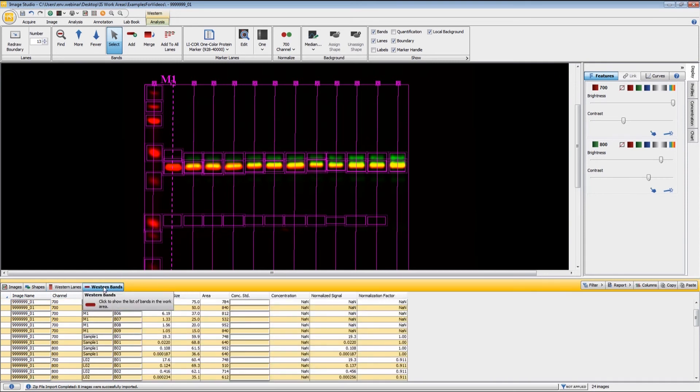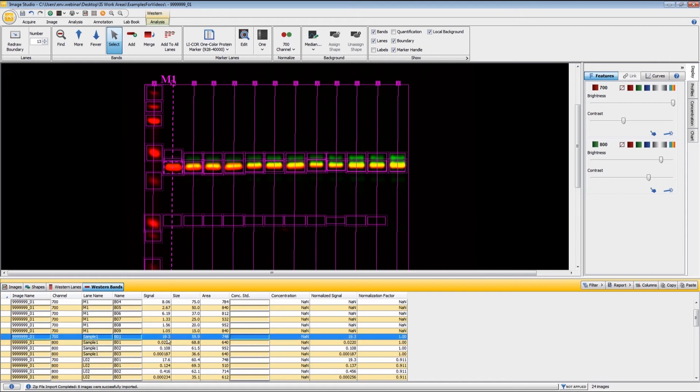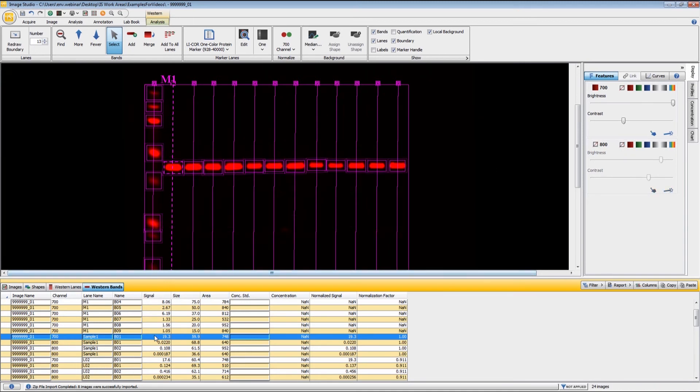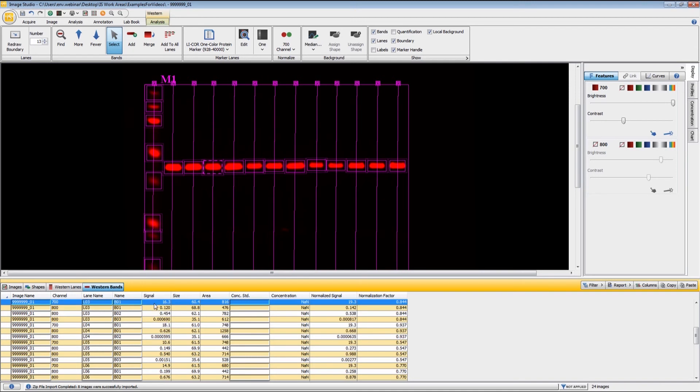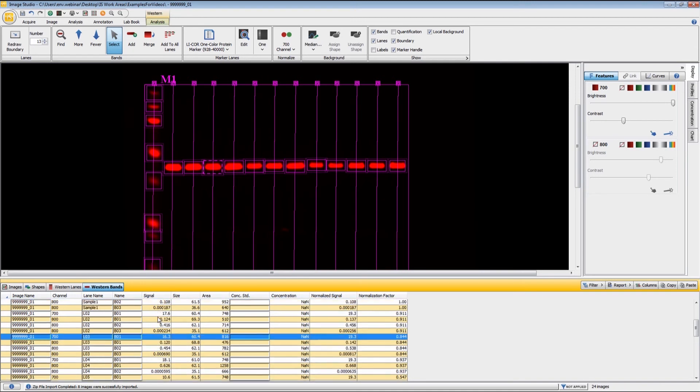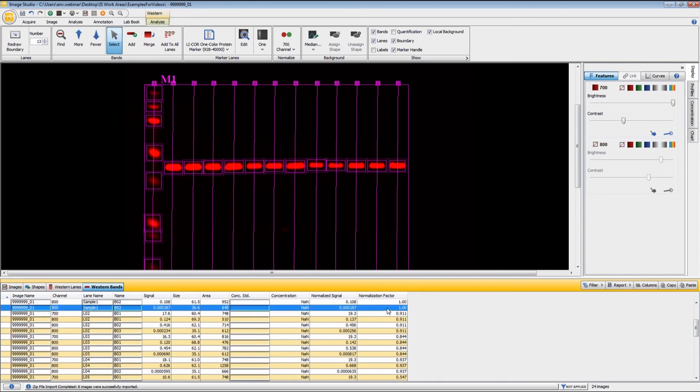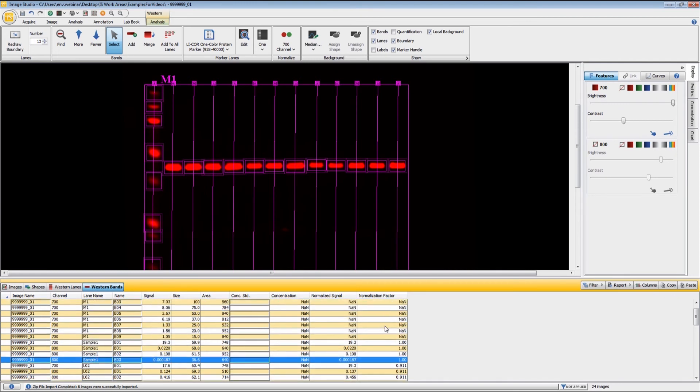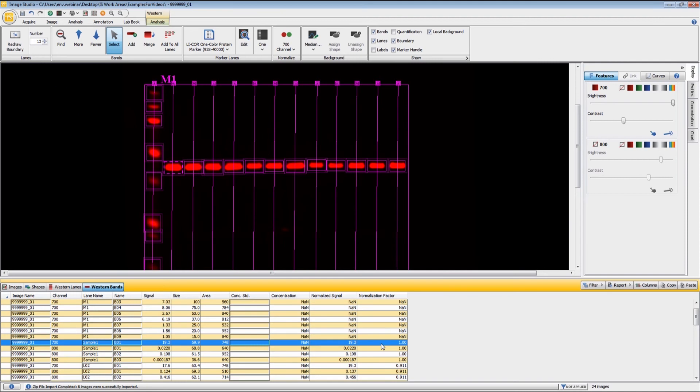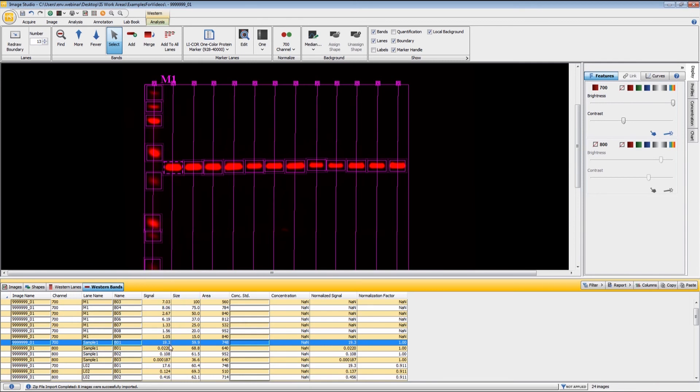In the bands table is where we get all of the data. Here, we get signal for this particular band. If I highlight that here, it changes the highlight up here. Or if I click on one of these, it changes the highlight down here. We have the signal, and we have the molecular weight. Out here to the side, we also have the normalized signal and the normalization factor. The way the software will do the normalization is it will find the band in your normalization channel that has the highest signal, which in this case is this band here just to the right of the molecular weight marker. That has a signal of 19.3.